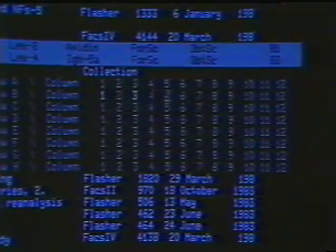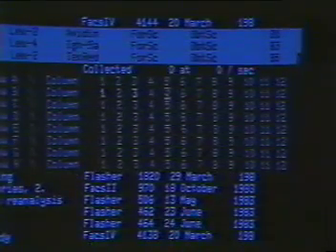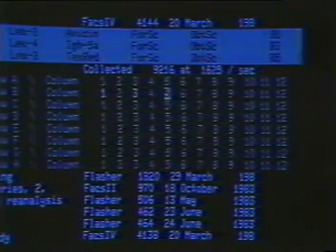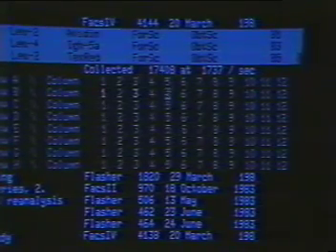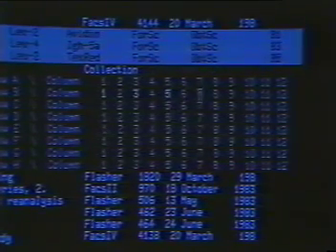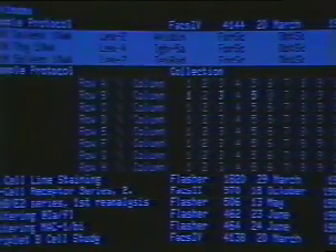Watch the right side of the screen now as we collect data for sample B5. When the correct number of data points have been stored in the warehouse, the magic secretary displays the total, then goes back to the collection ready mode. We have now completed the collection process for 3 samples. We see only the gray top portions of the 3 analysis cards because the analysis drawer is only open to its first level. Now we'll go to row H, sample 1.